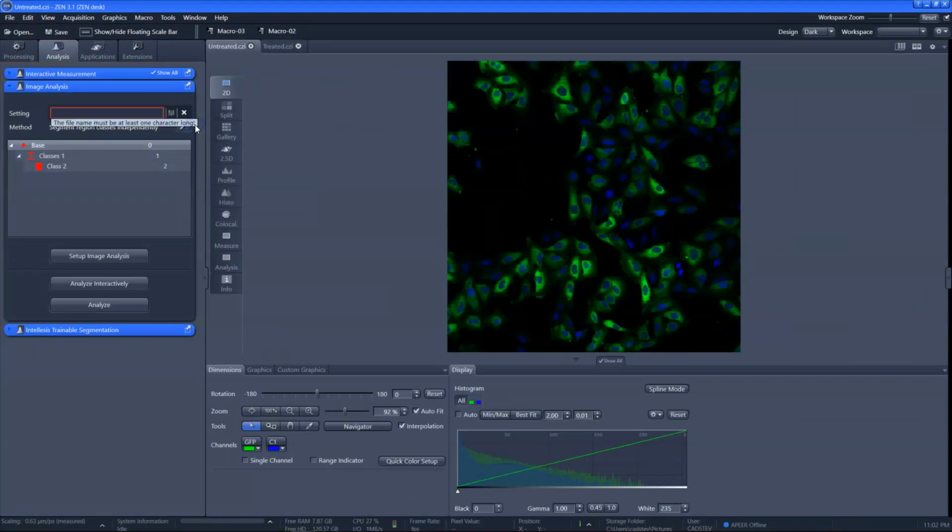A characteristic of the zone of influence analysis is that we are examining signal outside of the primary mask. That is, once we identified the object of interest, we are capable of examining signal outside of that object as well as inside the object. In order to employ this, we need to change the method of analysis here on the first page.